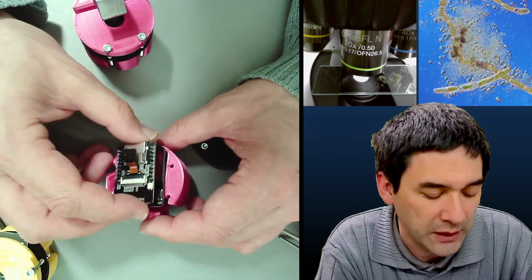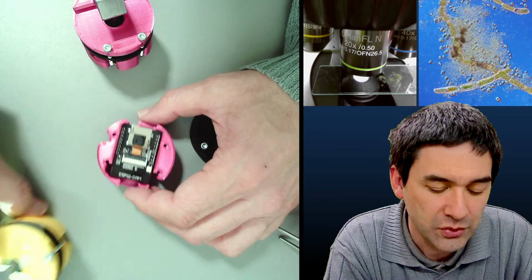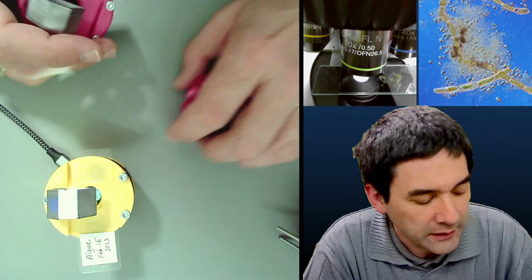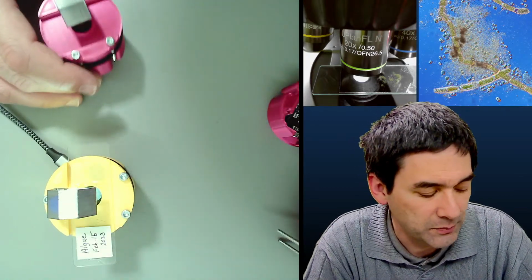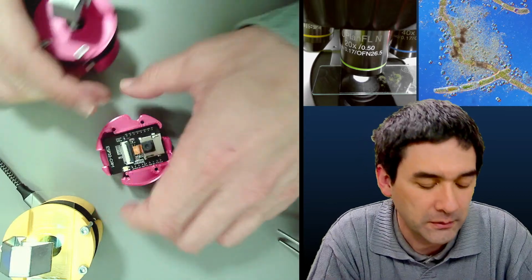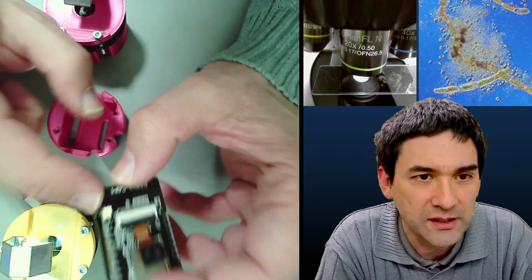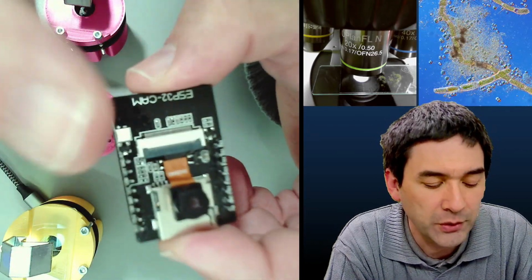And what I would like to do now is show you a few slides using this microscope here. Oh no! Before I do that, I just want to show you a little bit how the light actually works. This is because the light is quite fun. This yellow thing that you see over here, that's an LED, and it's pointing upwards.